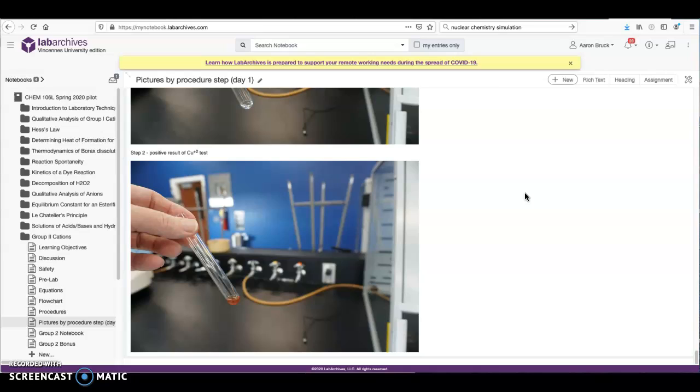The reason for that is that, in terms of a best case scenario, that's as far as you would have gotten today. So we are planning on maintaining the current schedule, at least according to what's written in the lab manual, for the next 2 weeks. As things update and change, we'll let you know. This Group 2 analysis was a 3-day lab, and we are going to meet it out like a 3-day lab.